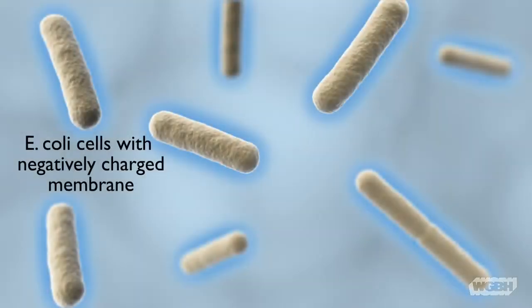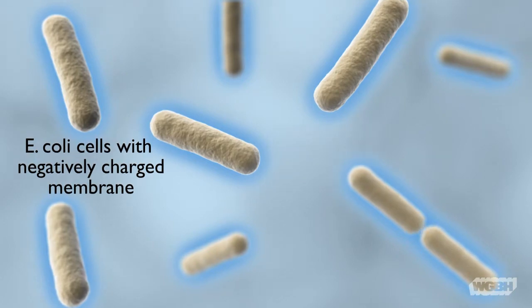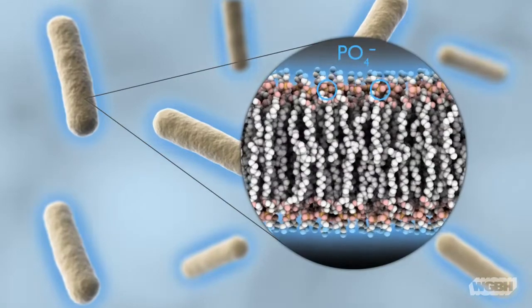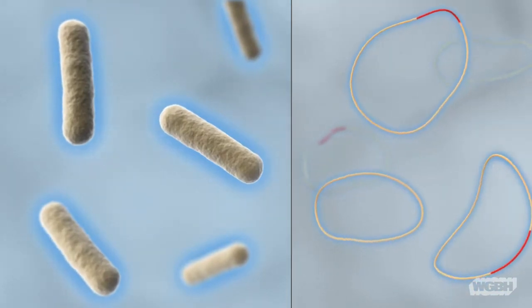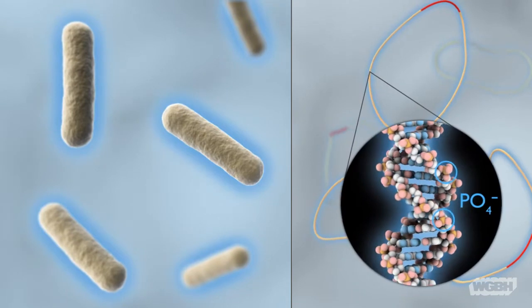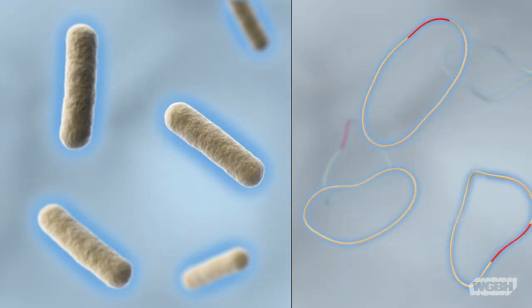The goal of transformation is to cause bacteria, in this case E. coli, to pick up DNA plasmids from their environment. The bacteria are negatively charged because of the structure of their lipid bilayer cell membrane. And the plasmids are negatively charged as well because of their DNA's phosphate backbone.